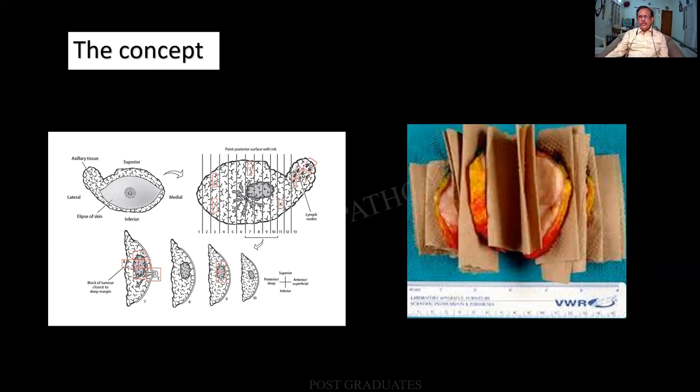Hence, even though the thickness of the tissue is 1 centimeter, the fixative has to pass through a depth of only 0.5 centimeter. The other 0.5 centimeters is covered from the other side. By this way, the tissue will be preserved, and later on there will be no ambiguity. The multiple methods of slicing and giving the bits shall be done later on. But ultimately, you find that there is a beautiful slice of tissue along with the tumor, the resected ends, as well as the nipple and areola, all well displayed. We shall go to the grossing of specimens at a later date.